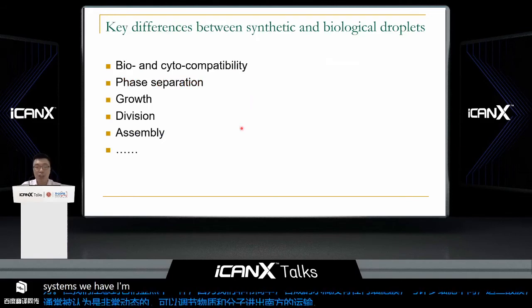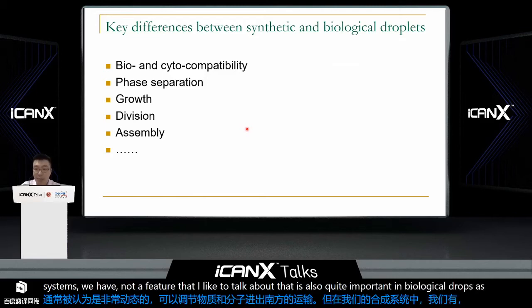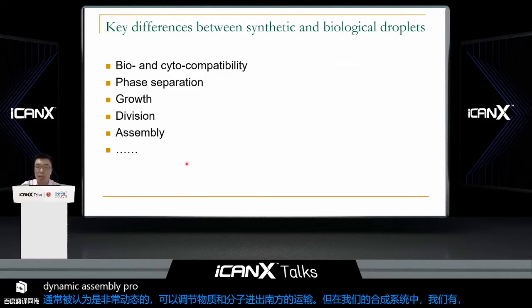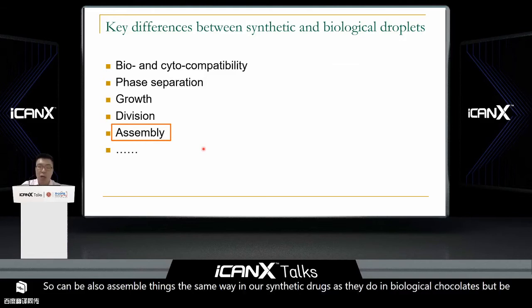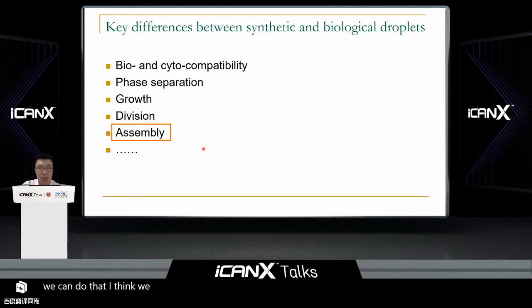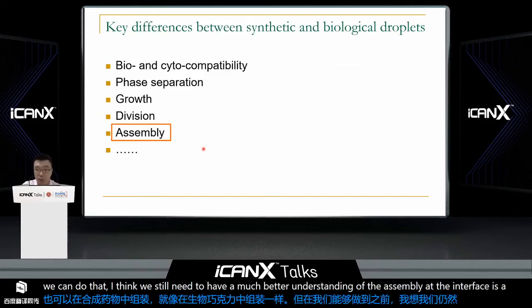Another feature that I'd like to talk about that is also quite important in biological droplets is the dynamic assembly processes. So can we also assemble things the same way in our synthetic droplets as they do in biological droplets? But before we can do that, I think we still need to have a much better understanding of the assembly at the interfaces of the biological droplets.